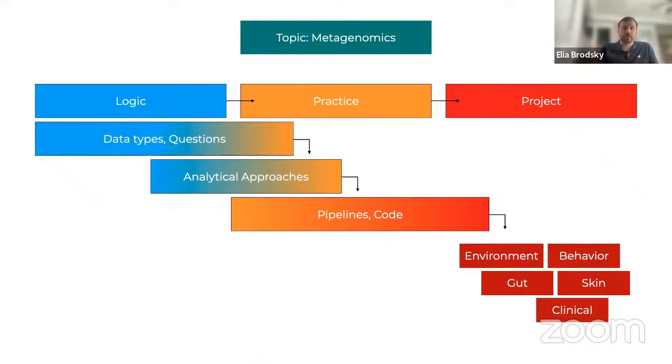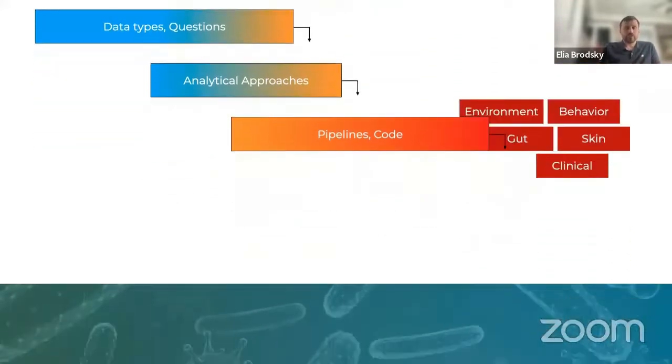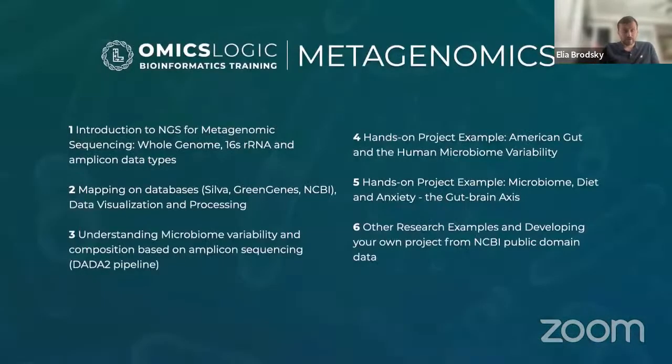And so that's where we cannot cover everything that potentially could be done, but this will be more based on a case study. So in each case, we will see what kinds of questions are being asked, what methods are being used to process the data, how is that data then analyzed, visualized, and annotated, and then what kinds of interpretation or conclusions we can arrive at, helping to study and find relationships between phenotype and what we find in this microbiome or metagenomic data. So this will be covered in several different sessions.